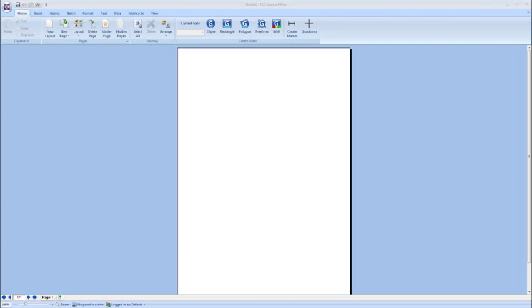So the way that the software works, let me take you through how we can insert plots and what a layout is, and then I'm going to show you more about some of the custom or canned layouts or templates that we've put together with Chemometec for many of their standard assays.